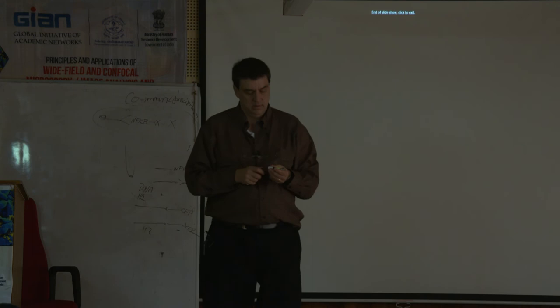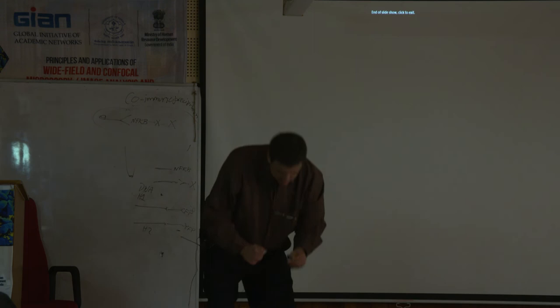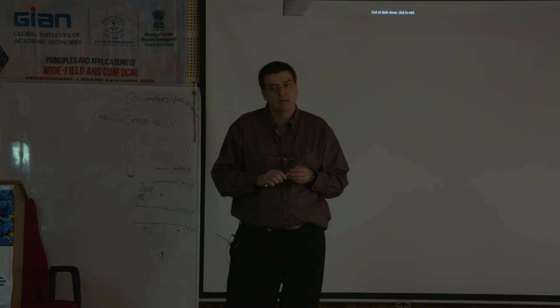Like I said, in the old days we did co-immunoprecipitations, that was all we had, but now FRET is like the next level. Because you could imagine you could put in a drug or something that would break that interaction. So you might have a FRET positive, add something that prevents those two from coming together. That could be the experiment to show, hey, they don't FRET. Now we can prevent that interaction, so we can maybe stop that signaling cascade or something like that.